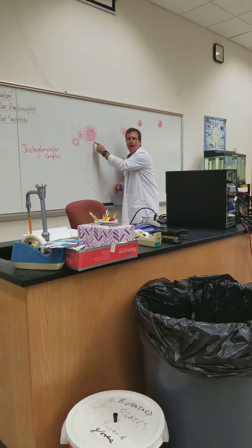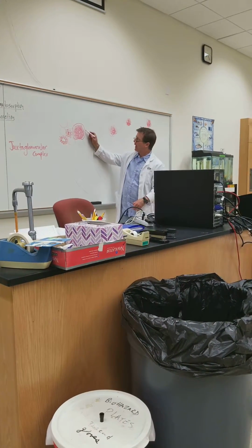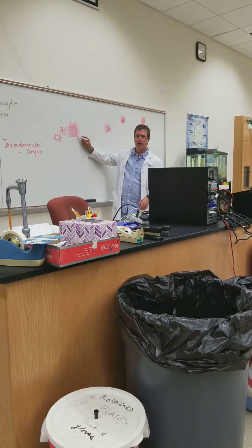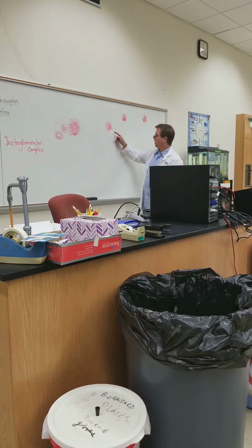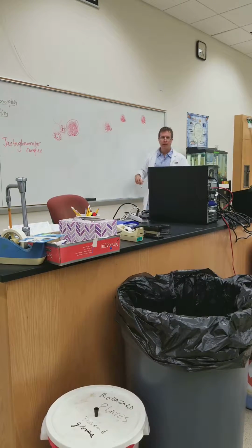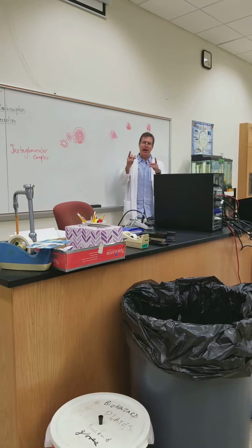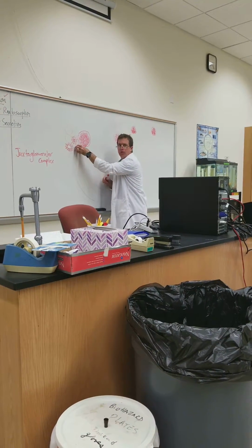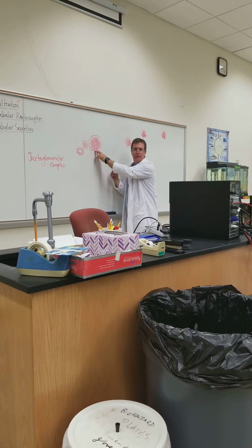Now here's how it's a little bit difficult to find. We can see it on some of these nephrons on the slide. How do we find that? You notice how I drew this white space around the glomerulus, but then right here, I showed it touching it. Likewise, right here, likewise, right here. That's because I have a lot of practice looking at this slide. So try your best on high power to find a glomerulus that has tubule cells that look like they're sticking right up against it, with no white space.